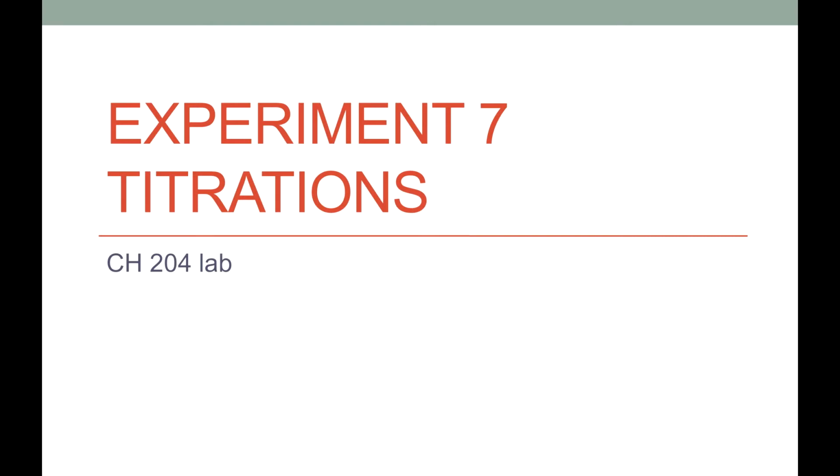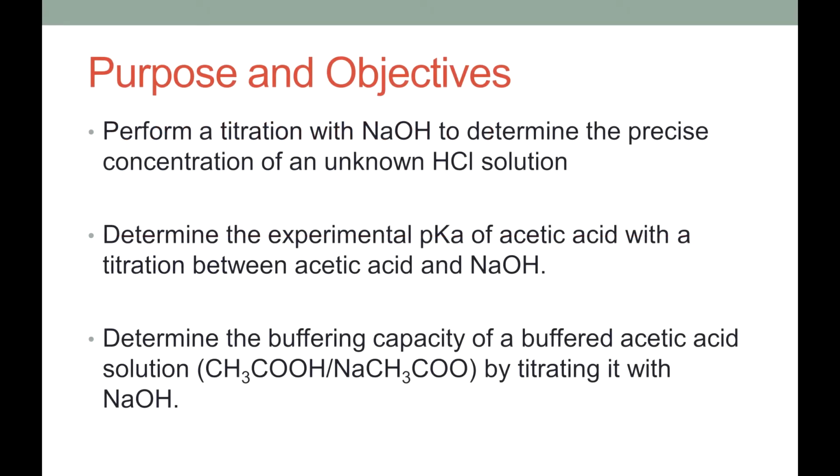Welcome to this video lab where we're going to be performing an experiment concerning titrations. The purpose of this experiment is to perform a series of titrations to determine the concentration of an unknown solution of hydrochloric acid and to determine the buffering capacity of a buffered acetic acid solution.